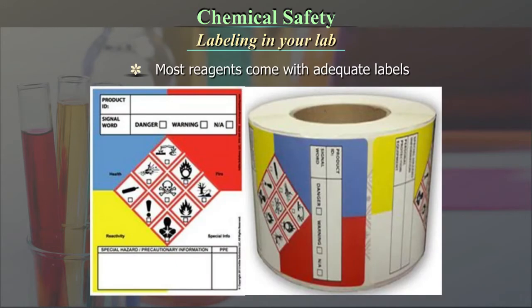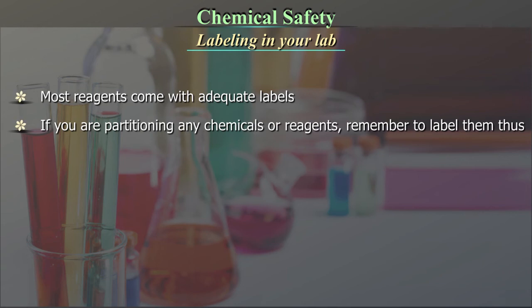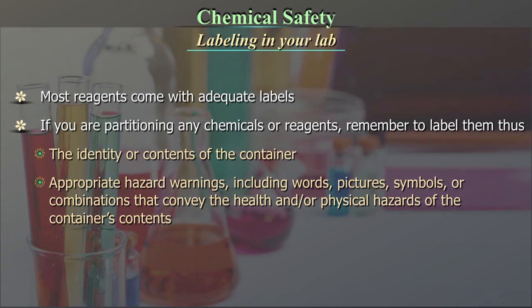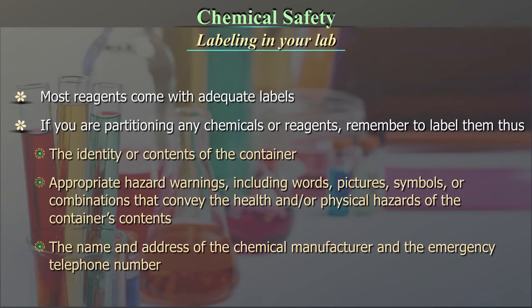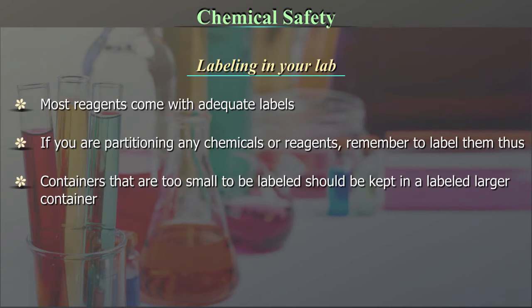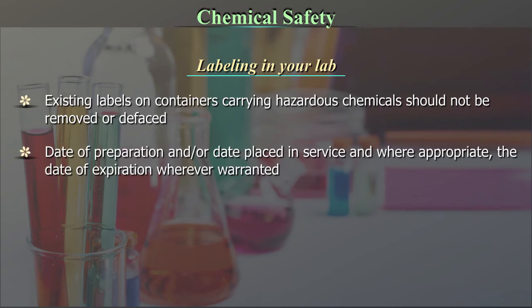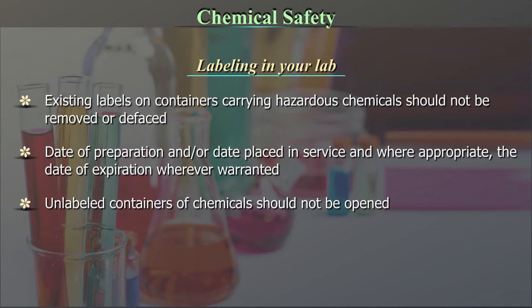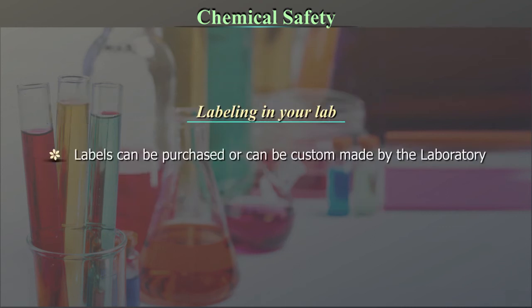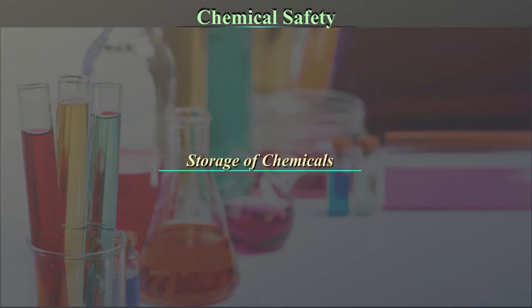Labeling in your lab: Most reagents come with adequate labels. If you are partitioning any chemicals or reagents, remember to label them with: (1) the identity or contents of that container; (2) appropriate hazard warnings including words, pictures, symbols, or combinations that convey the health and/or physical hazards of the container's contents; (3) the name and address of the chemical manufacturer and the emergency telephone number; (4) containers that are too small to be labelled should be kept in a larger labelled container; (5) existing labels on containers carrying hazardous chemicals should not be removed or defaced.